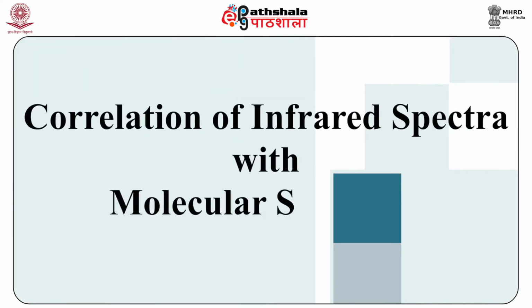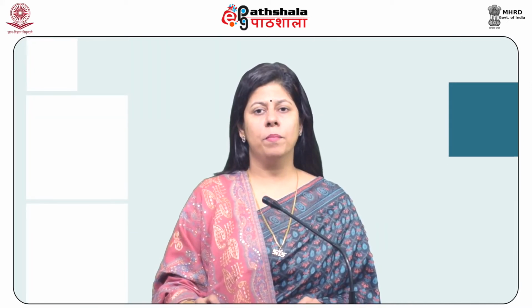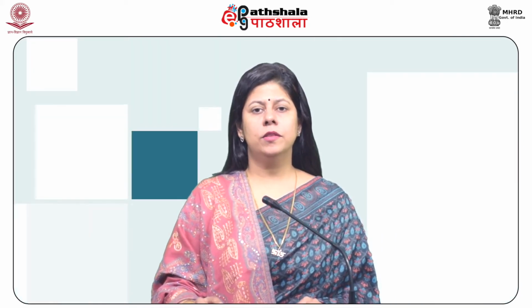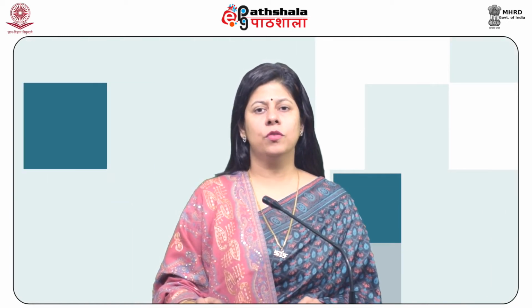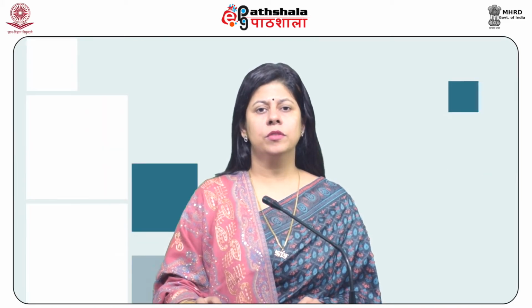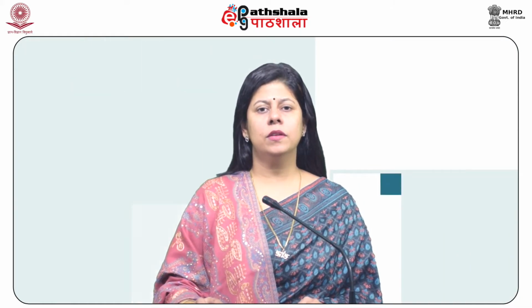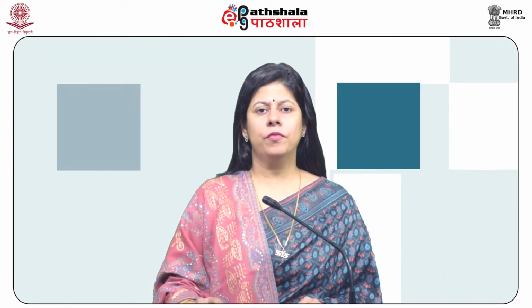Correlation of infrared spectra with molecular structure. The infrared spectrum of a compound is basically the superposition of absorption bands of specific functional groups, yet slight interactions with the surrounding atoms of the molecule impose the stamp of individuality on the spectrum of every compound.